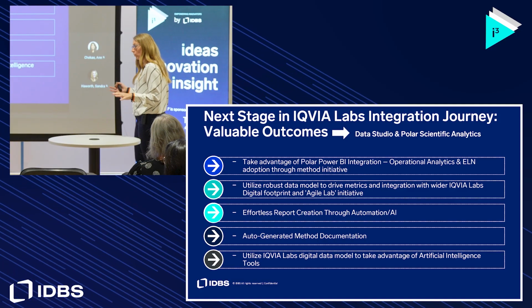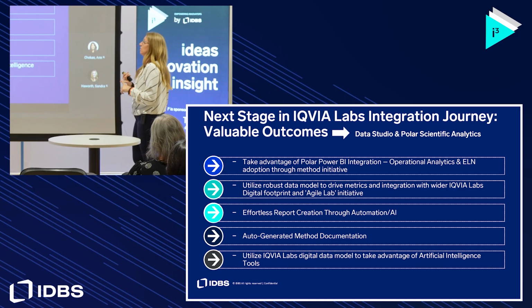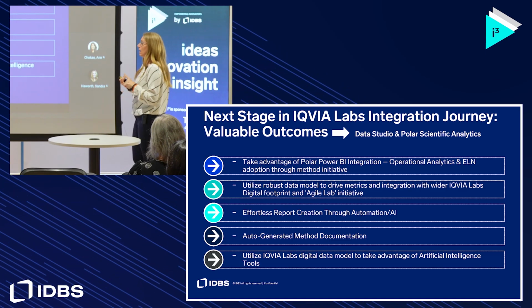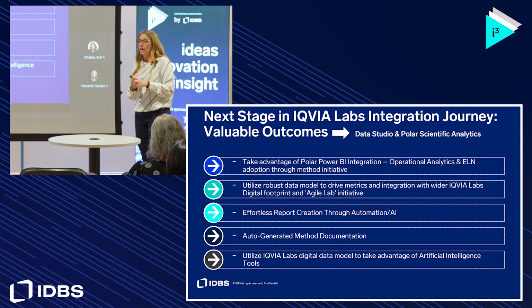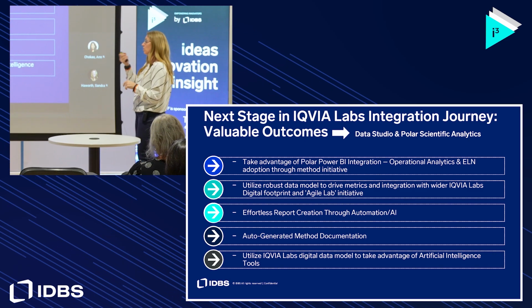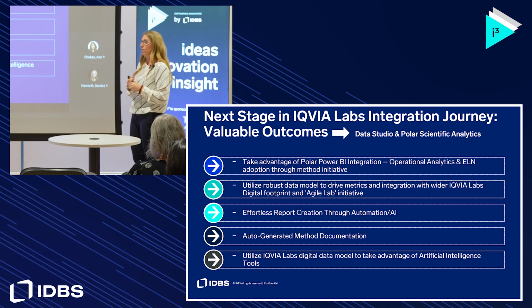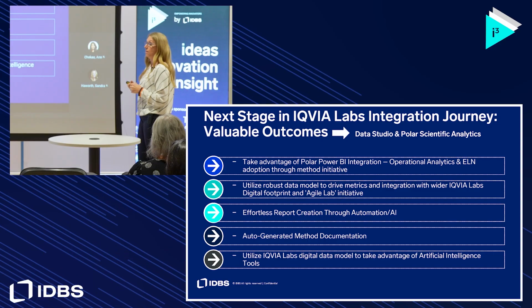One other thing that we're trying to automate, like I mentioned, is all of the validation tables that we designed in ELN and all of the data tables that you can get from Watson. But someone still has to manually copy and paste all that data and put it into a final report. So we're looking into tools to help us automate our report generation, as well as our method document.